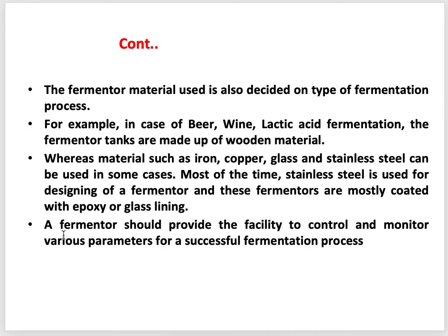Finally, a fermenter should provide the facility to control and monitor various parameters for a successful fermentation process. Here, parameters mean pH, temperature, pressure, foam. So, we learned about the basics of fermenters.